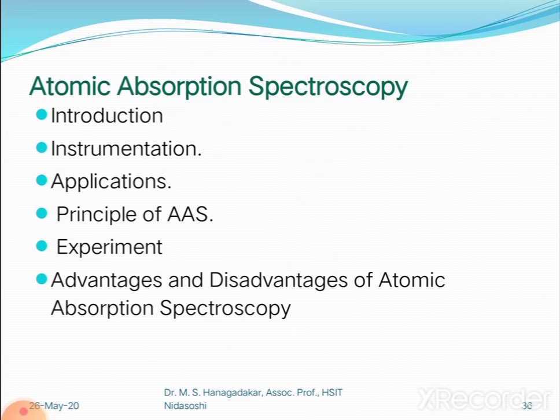So let us discuss the content of the presentation. It follows like this: beginning with introduction, instrumentation, applications of atomic absorption spectroscopy, principle of atomic absorption spectroscopy, experimental method, advantages and disadvantages of the atomic absorption spectroscopy technique.